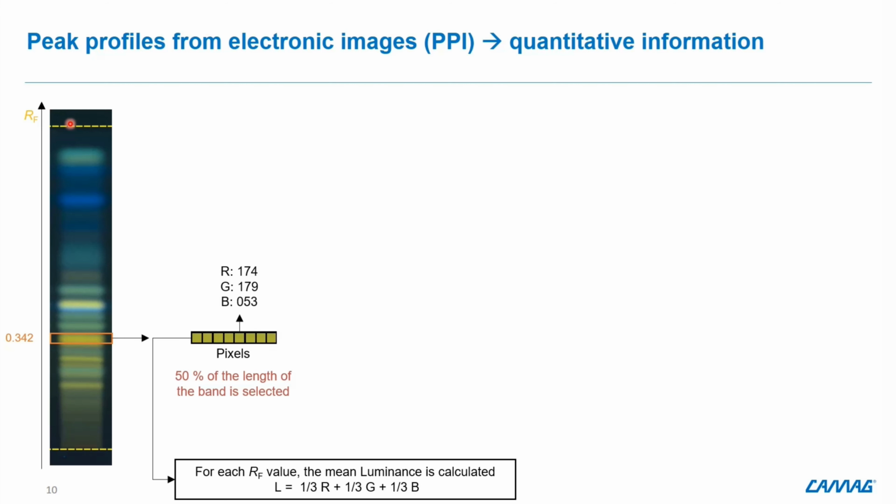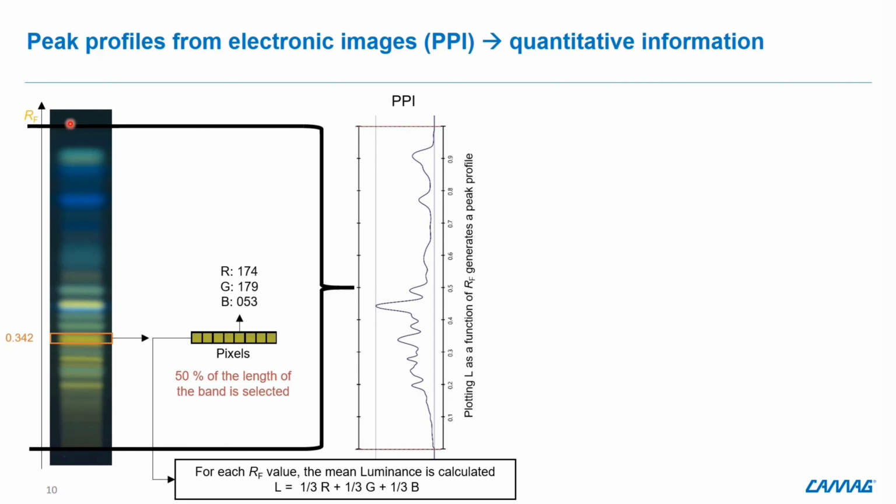For each track, peak profiles are obtained by a mouse click, and this will give us the information about the content of the different sample components or the content of a class of substances. The pattern of the entire sample is shown, telling the truth about its nature and origin. A marker approach can more easily be falsified by adding the target analytes for adulteration. The intensity ratios of the peak profiles within a chemical fingerprint will immediately detect cases of adulteration.